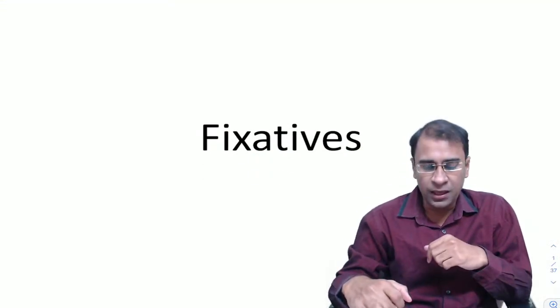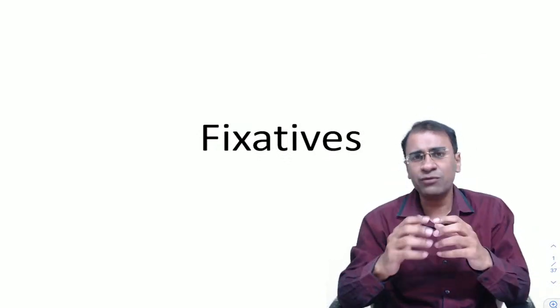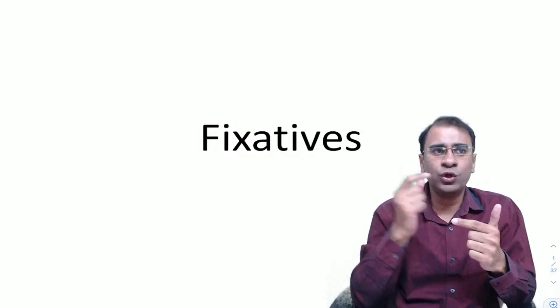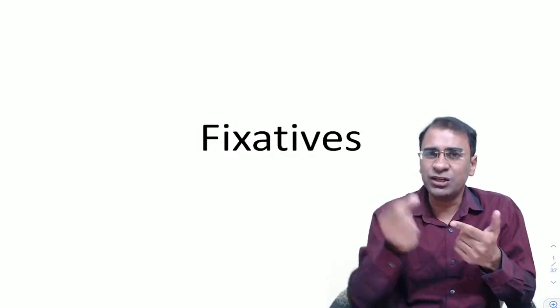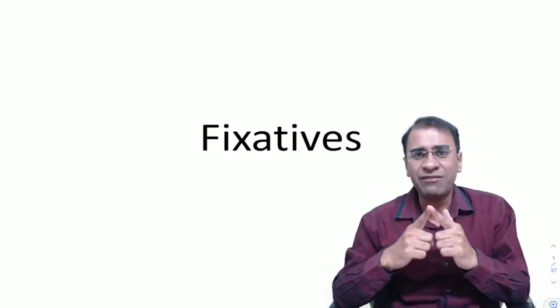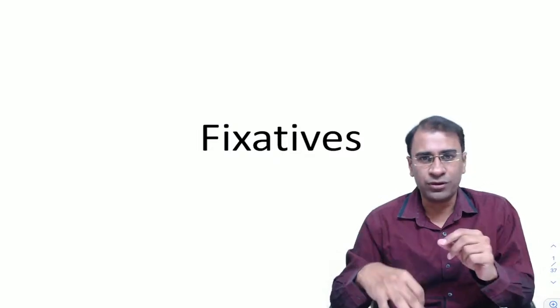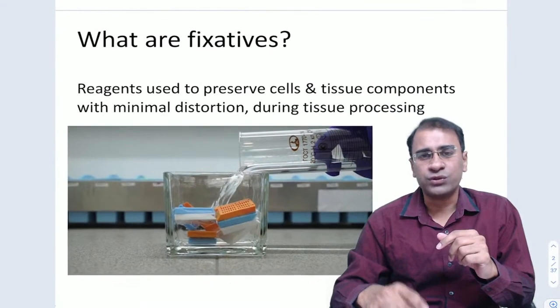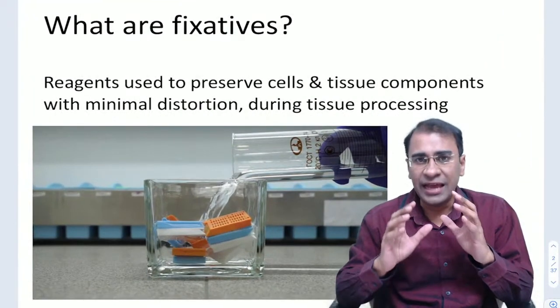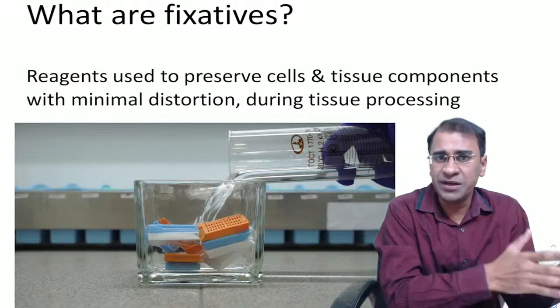Okay, number one, first of all, where have you seen fixatives? When you come to the term fixative, often what comes to our mind is Fevicol, where we fix something to something. If I want to fix these two fingers together, I need a Fevicol. Now, does that exactly mean the same in pathology? Let's find it out. So, fixatives, what are those? Anything in pathology which will actually preserve a slide or its smear is called a fixative.